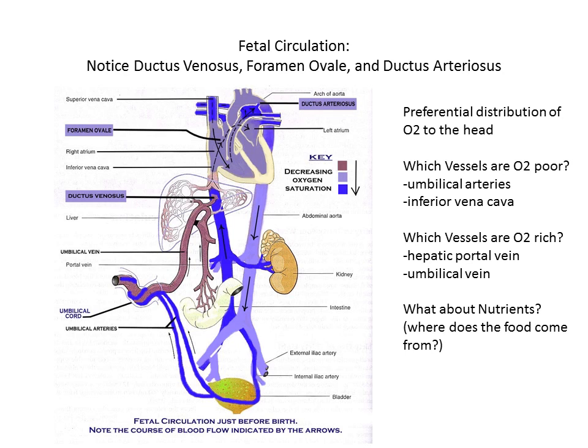So ultimately, we pump this into the backside of the vascular system into the vena cava, where the blood mixes. So most of the fetus is never actually dealing with fully oxygenated blood. It's dealing with a mix of very deoxygenated infused with freshly oxygenated stuff coming from the placenta.